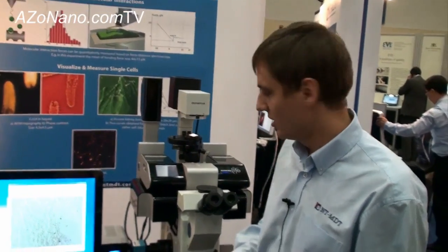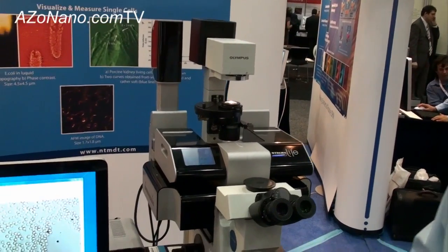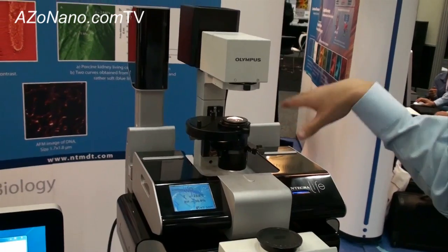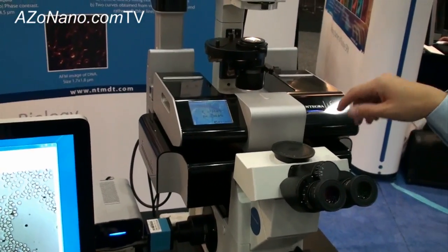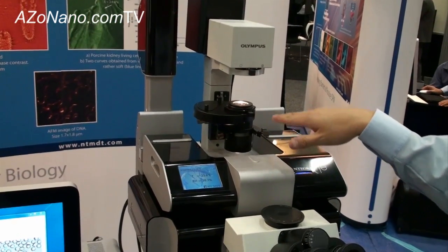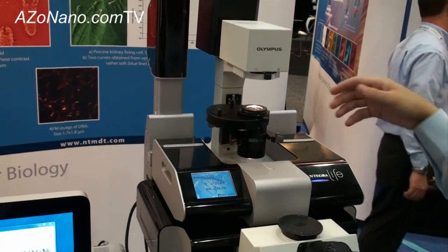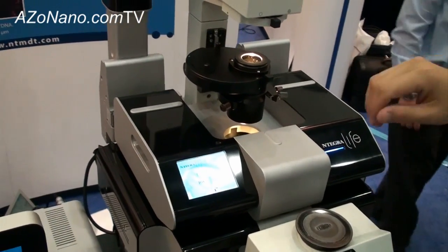I wanted to tell you about our new system, it's Integra Life. It's a scanning probe microscope or atomic force microscope which is dedicated for biological research. Here you can see this AFM stands on the inverted optical microscope, which can be different types, and at the same time you use the scanning probe. From the top you have a condenser up to 0.55 numerical aperture.